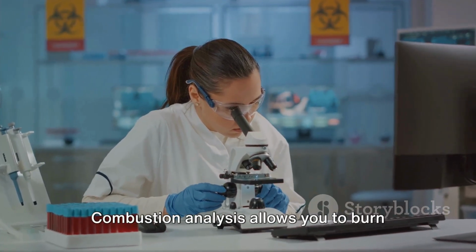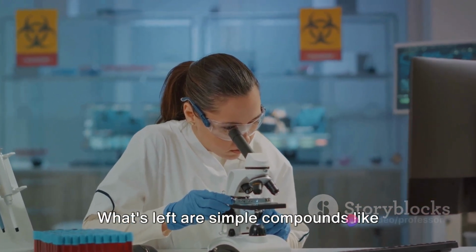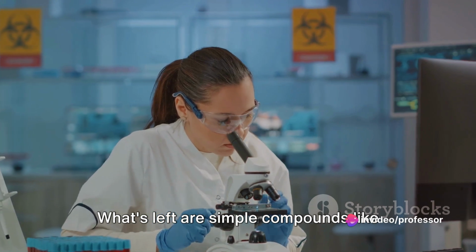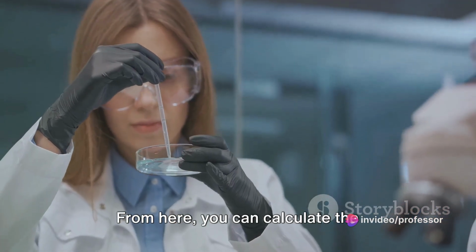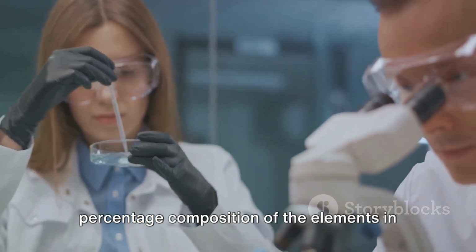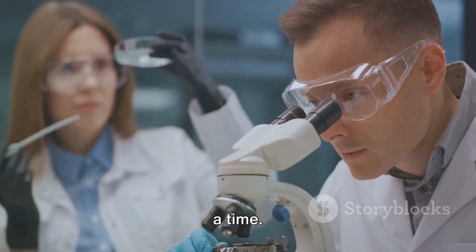Combustion analysis allows you to burn that sample in an excess of oxygen. What's left are simple compounds like carbon dioxide and water, which can be measured. From here, you can calculate the percentage composition of the elements in the original mystery sample. It's like solving a puzzle, one piece at a time.